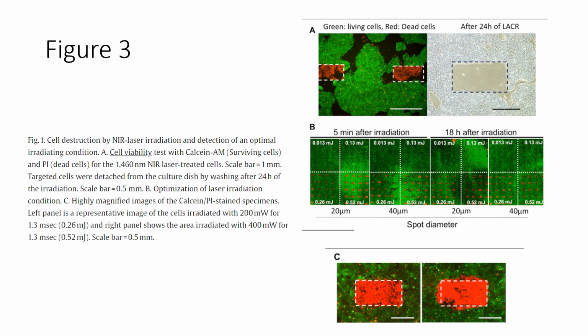And here is the last one, which is my favorite, save the best for last. This is actually showing cells after radiation after a certain amount of time. And the cells that are in red are actually the ones that have died. And as you can see in figure B, the more time that went on after radiation exposure, the more cell death that has occurred. And I thought that was pretty interesting to actually see it in a picture.